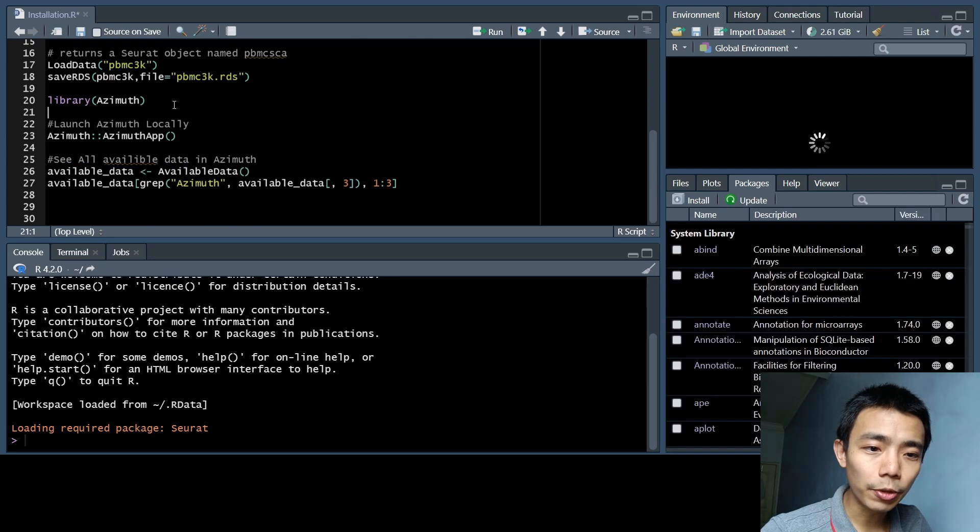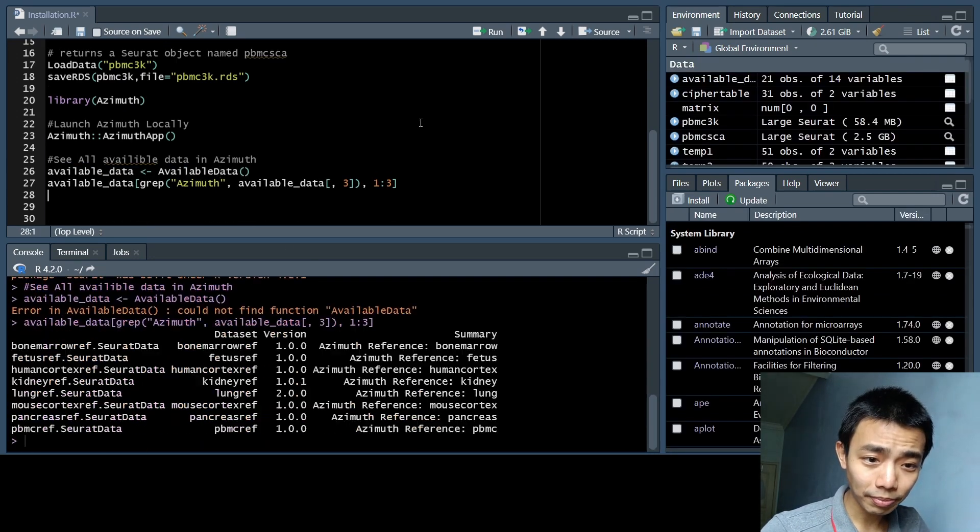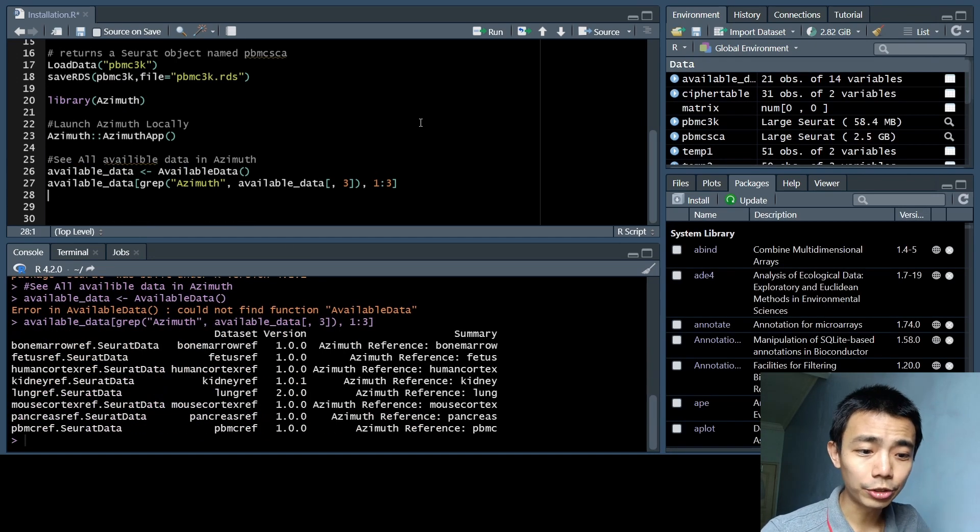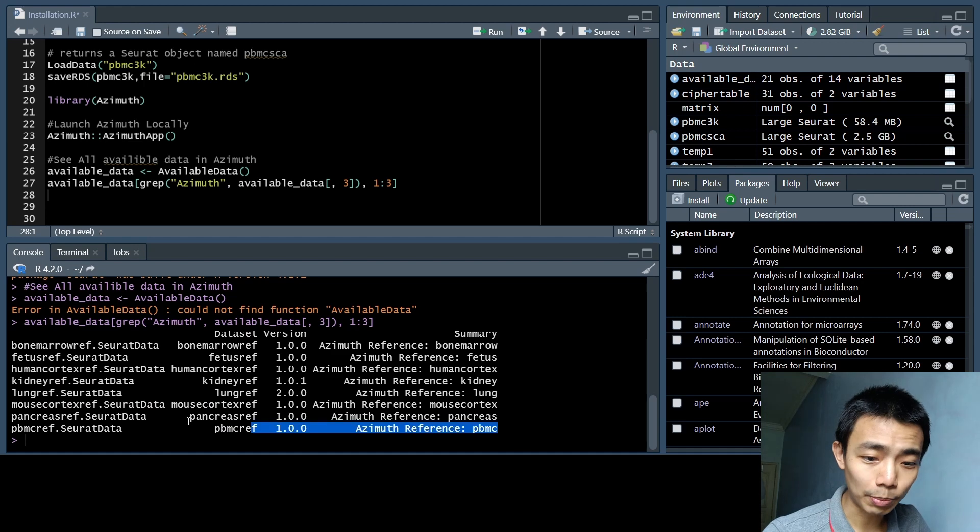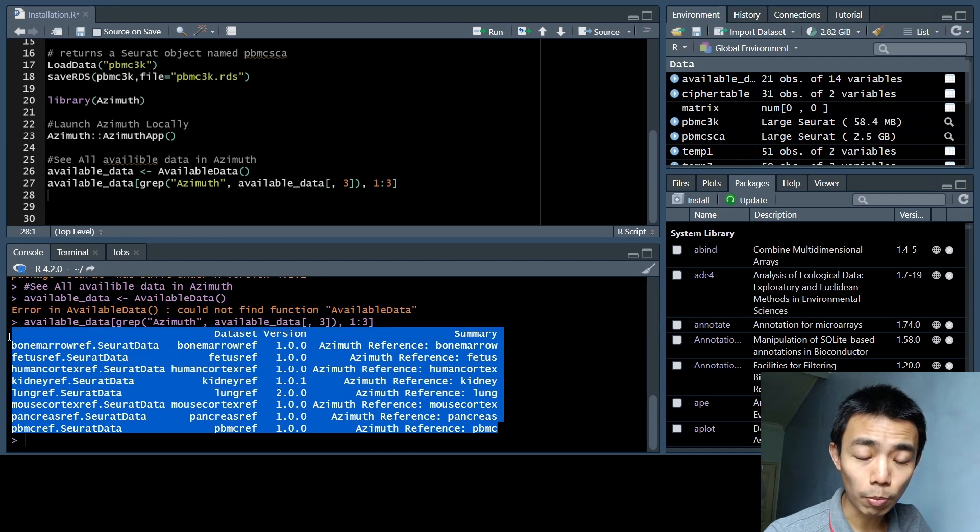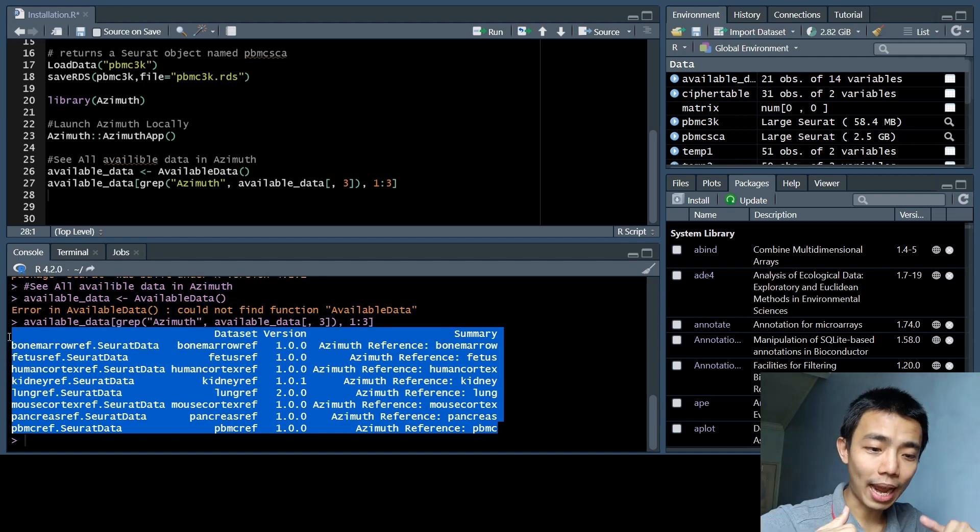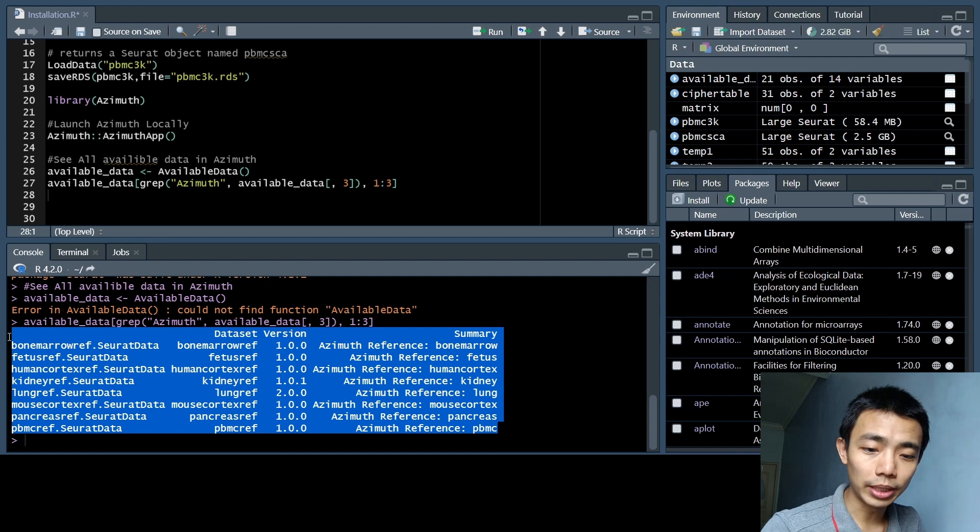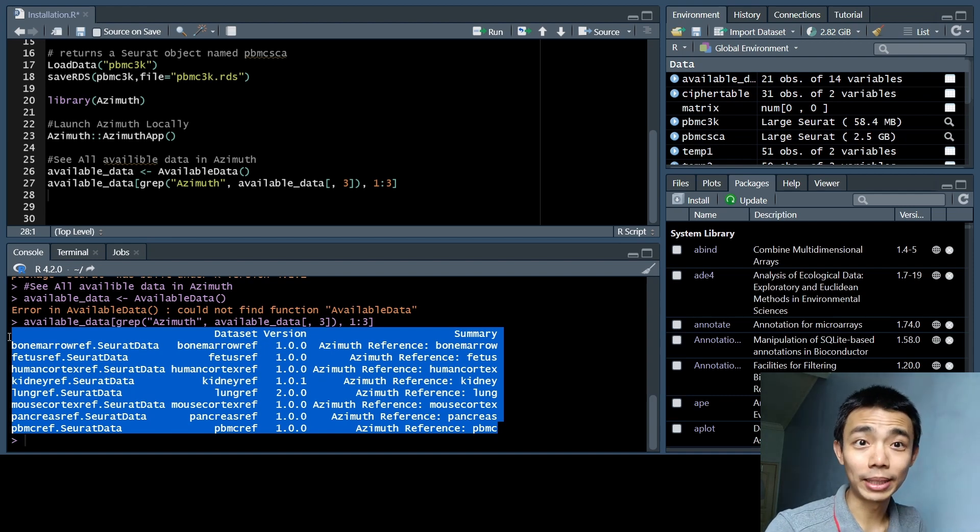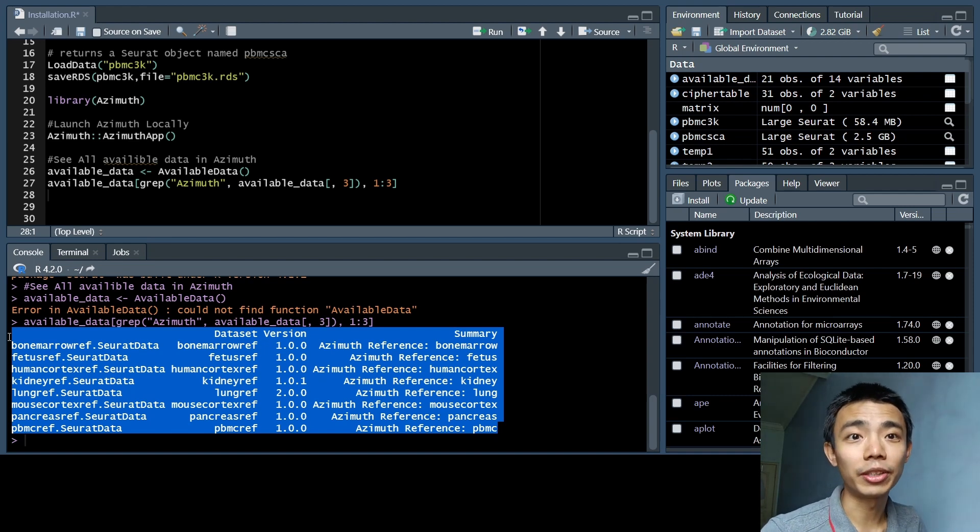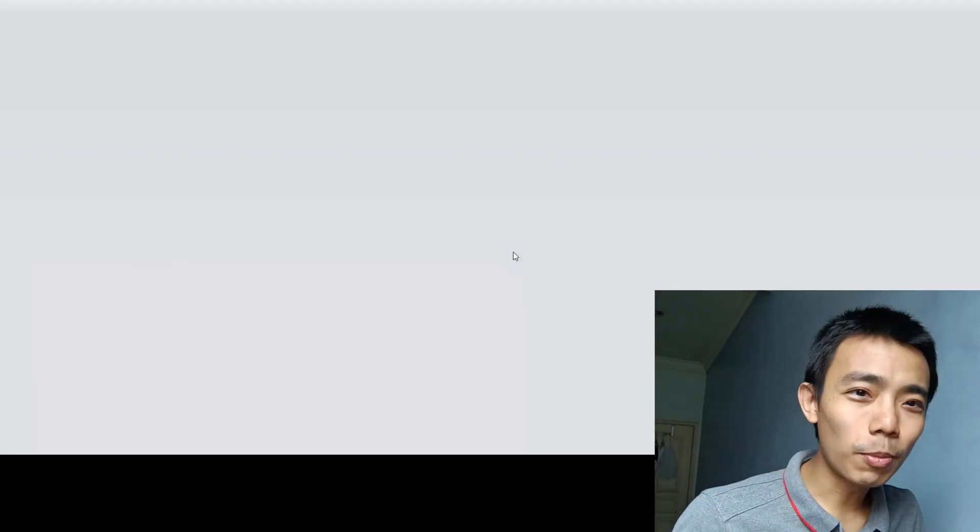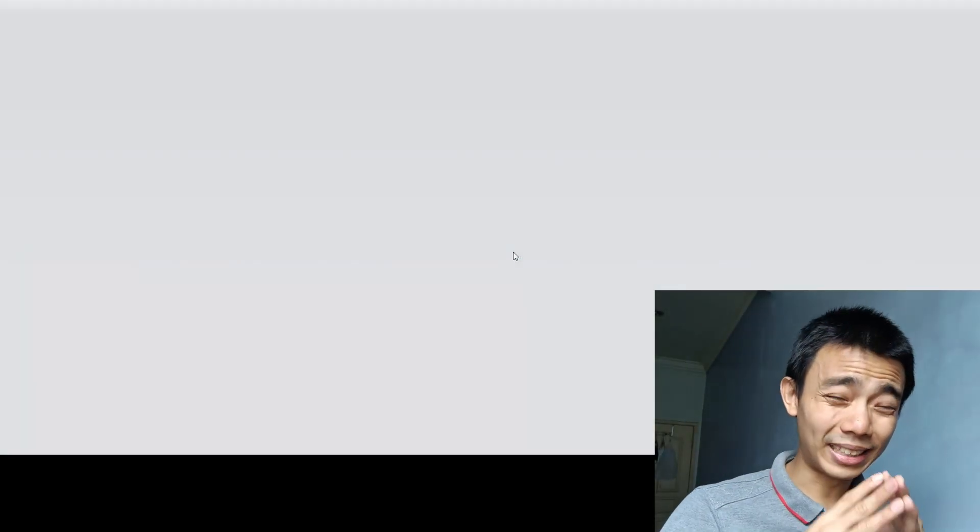That's basically the whole thing. And you can actually see the Azimuth reference once my R has finished crashing. In Azimuth, you can also see these are some of the available data that you can actually use inside Azimuth at this moment of time. And at the time of this video, it's only eight of them, but I'm sure that they'll update it maybe a week, two weeks, two months when you actually find this video and watch it.